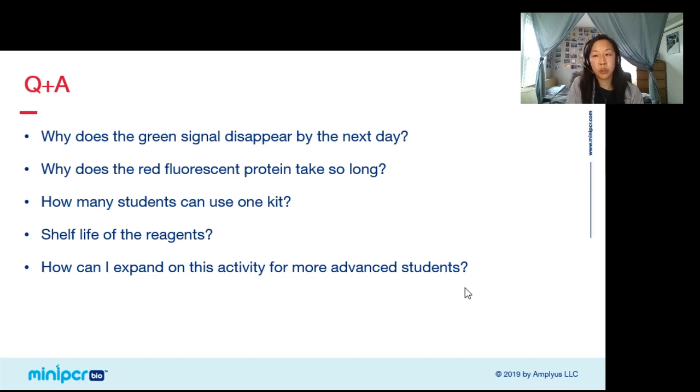And there are other things you can do, adjusting the pH, adjusting the temperature that you incubate them at, adding things like salt or rubbing alcohol. So there's a lot that you can do.